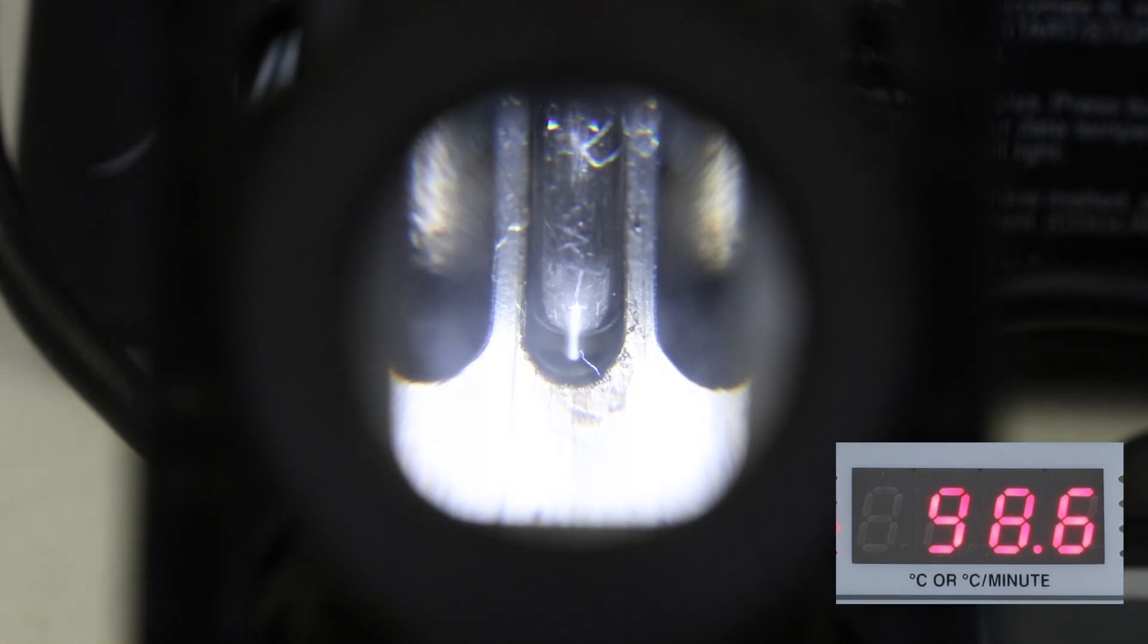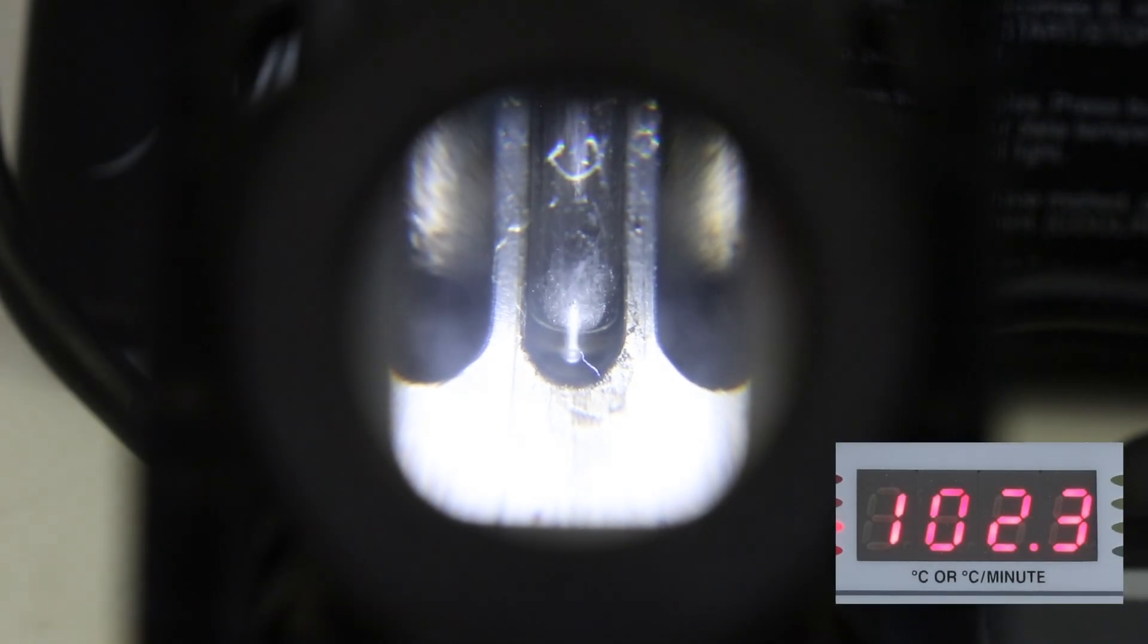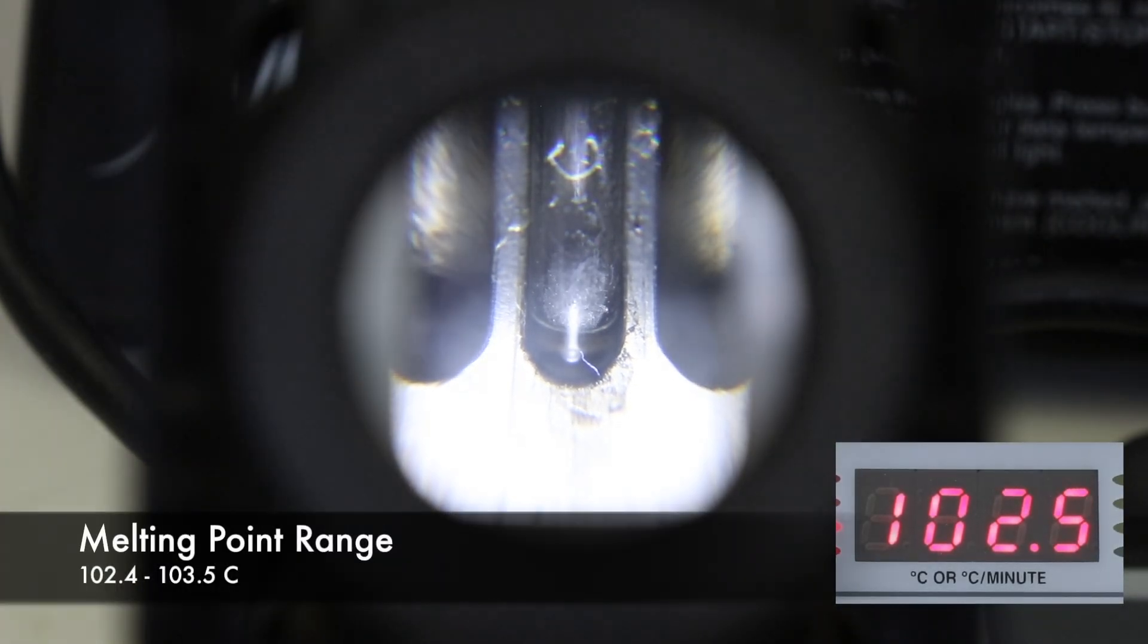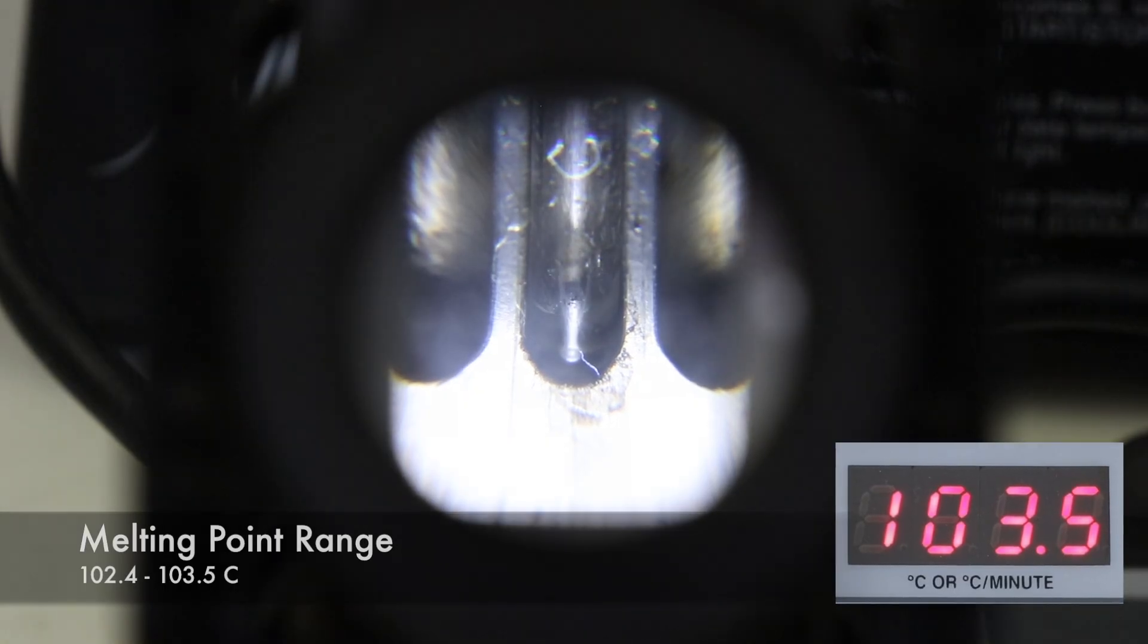I'll take a melting point starting a few degrees lower just in case there is contamination, but it looks like the solid starts melting around 102.4 and finishes around 103.5 degrees Celsius, so there probably is some contamination in there and we can check for that on the IR now.